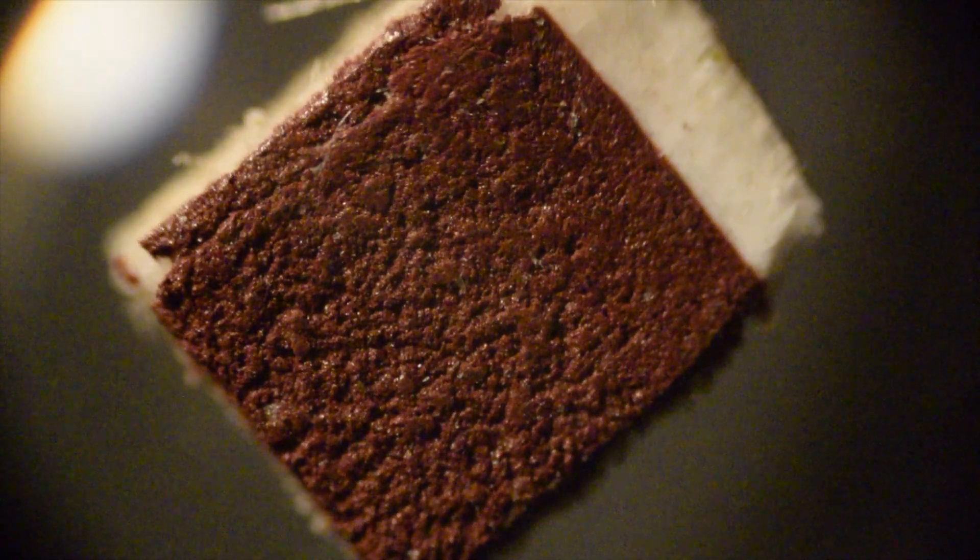And if we go in even farther at 400 times magnification, it's a little bit more difficult to see. But here is the match box — the section of the match box at 40 times magnification. And then let's go further into 100 times magnification, and you can see again a little bit of granules of different compounds. And then we have it at 400 times magnification.